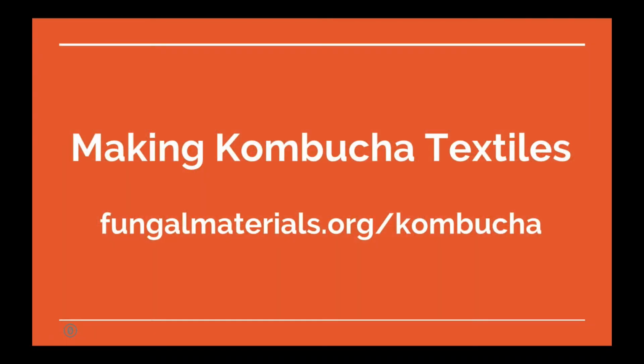I'm going to give a quick overview of the process of making kombucha textiles, and there's a detailed recipe and some more resources at fungalmaterials.org/kombucha. I'm going to take this approach so that we can make these videos a little bit shorter and lighter, and then for the references while you're actually doing these things, you can pull up the website and there'll be a list of steps that you can walk through.